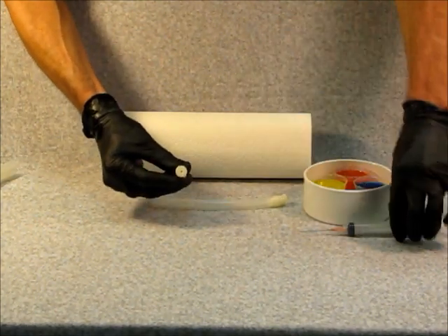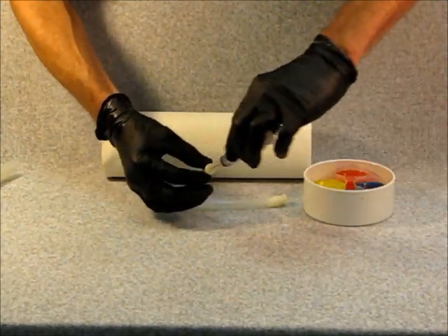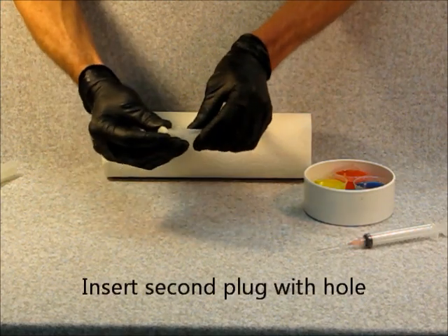Next, insert the second end cap that has a hole into the other side of the tube.